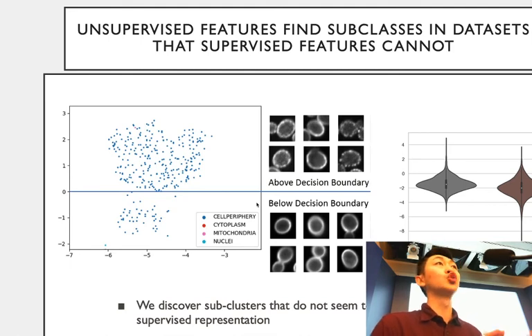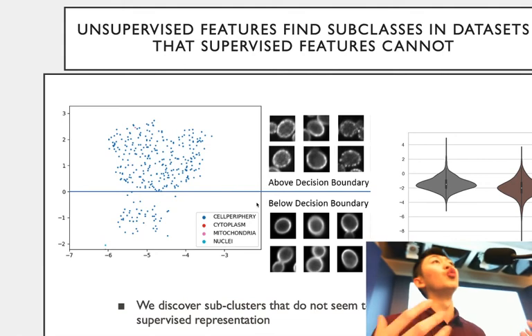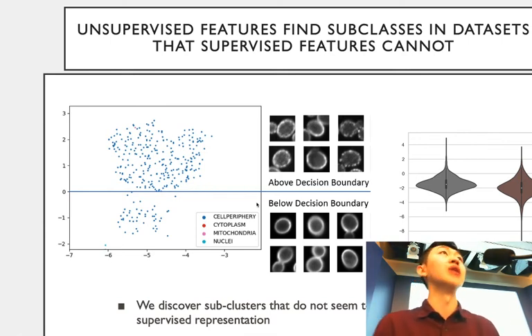Although we often train these classifiers supervised, we have to talk about what biases we're introducing to a representation that reflect our prior knowledge, right? The reason we like these self-supervised methods a lot is that they teach themselves, and in that way, they're unbiased by prior knowledge, and then you can discover things that would otherwise be hidden by your preconceptions of your data.